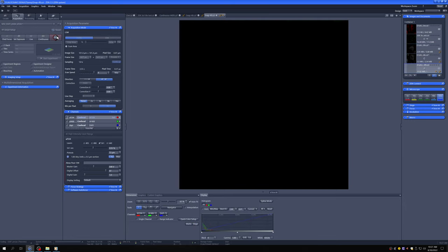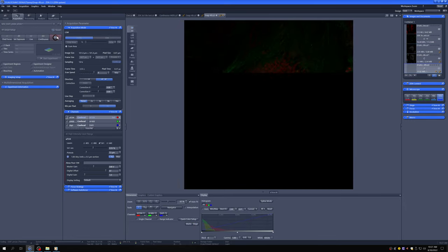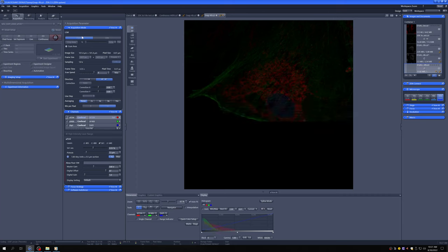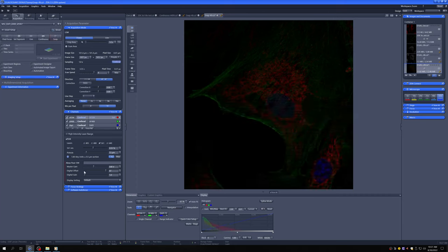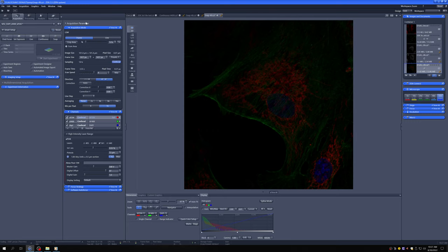What snap does is it takes a single image with all the settings you have here, okay? And so here's that image.